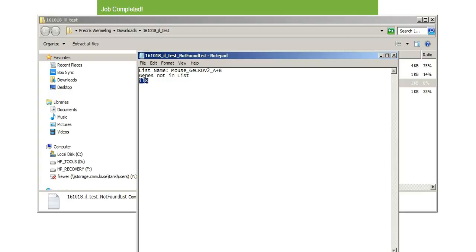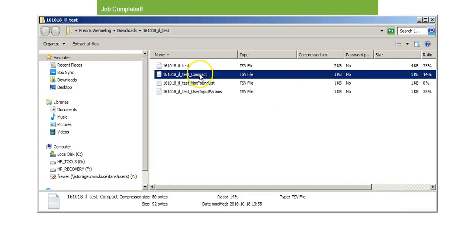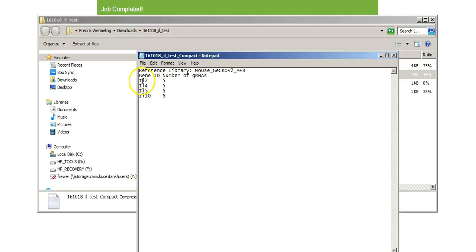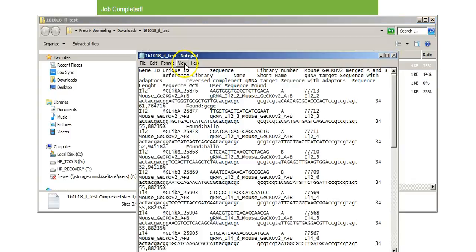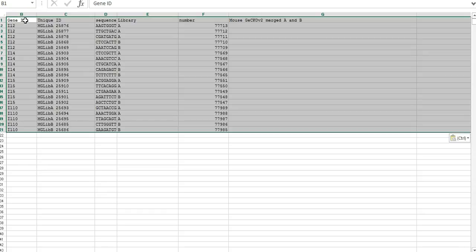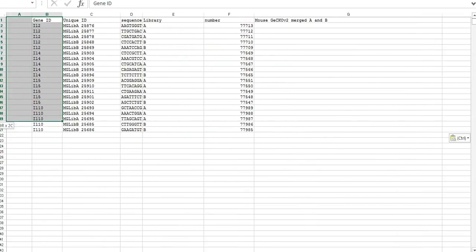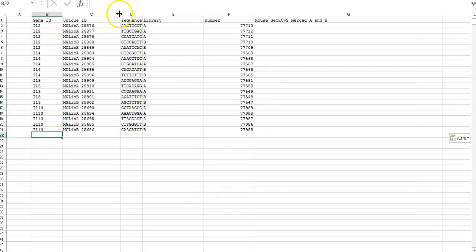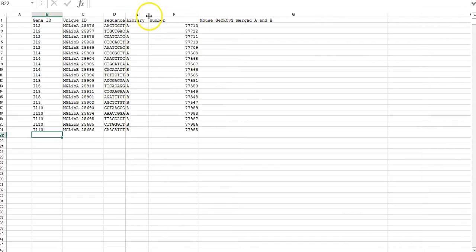In the mouse you would talk about CXCL1 and CXCL2. The not-found list functionality is important: if you ask the software to suggest a library against a long list of genes, you want a report if the software failed to find some of them. Here you simply know that IL8 — it didn't manage to make something against it. Then you can think about alternative names or use another list. We also have a compact output list showing what the library contains — for example, IL2 has five gRNAs, IL4 has five, as expected.